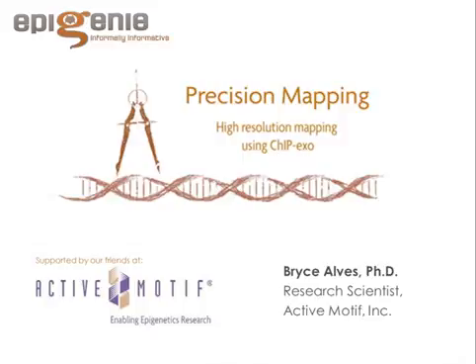We've done some input samples, but with the ChIP-Exo technology, due to the amount of manipulation of the sample as you run to the next one, it gets so different from what you initially put in because you're cutting it back, making it more concise, that a comparison between an input and a ChIP-Exo sample is like comparing apples and oranges. That's what we've found it to be. I hope that answers the question.